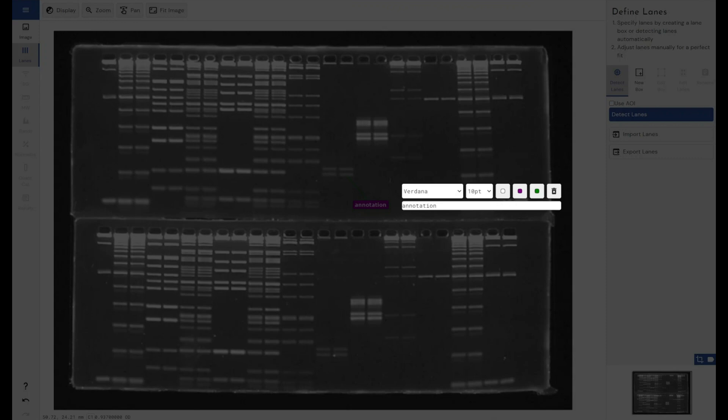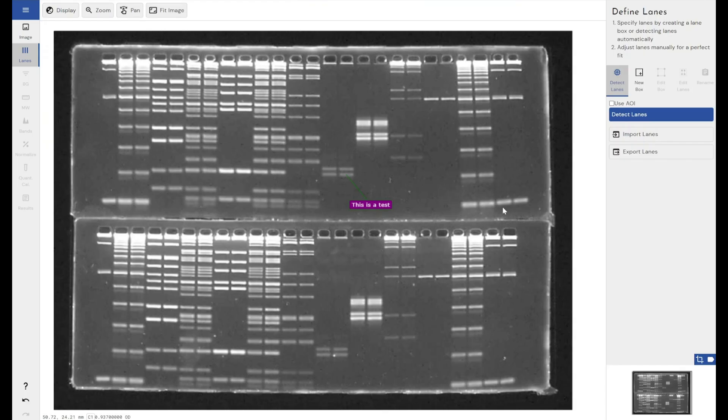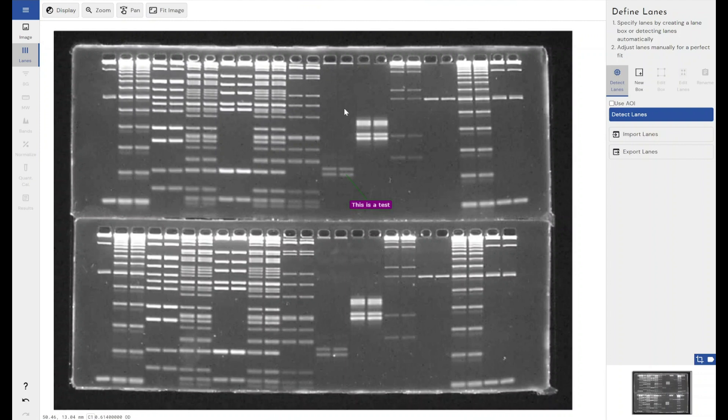We can type in here, this is a test for example. Press enter and leave, or we can just left click outside of the editing mode to gain access to that. And then it's in, it's part of our image now. So we've got our annotation added.